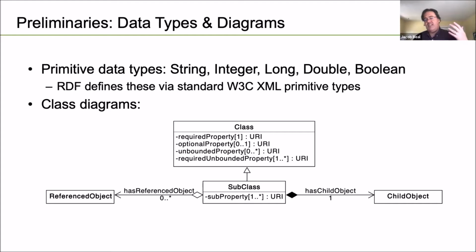It doesn't make sense to say EcoRI cuts here if I'm not talking about that as part of the plasmid. Other elements we reference rather than including them in. That's, for example, if I talk about my plasmid has a copy of a GFP coding sequence on it, the GFP coding sequence exists independent of the fact that I happen to be including it in this particular plasmid.